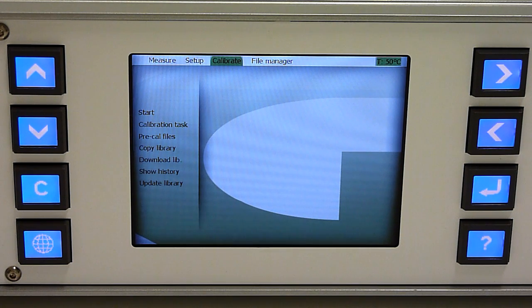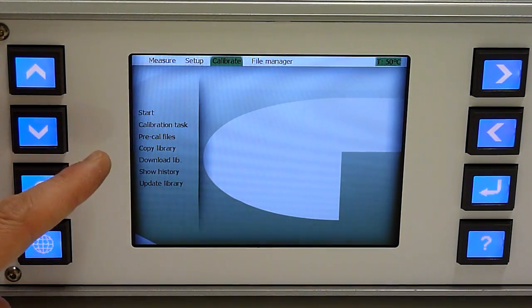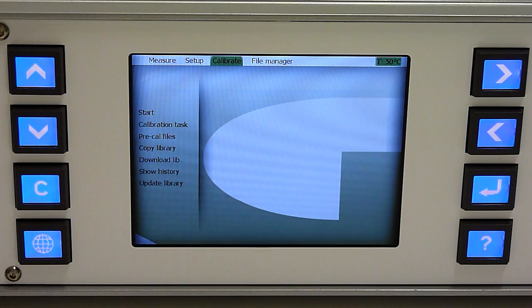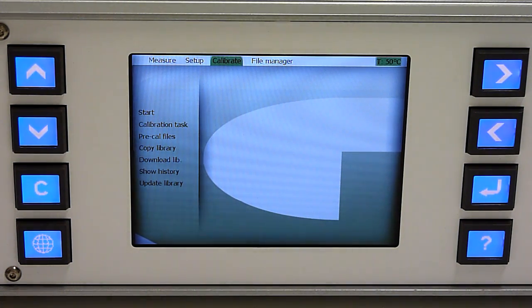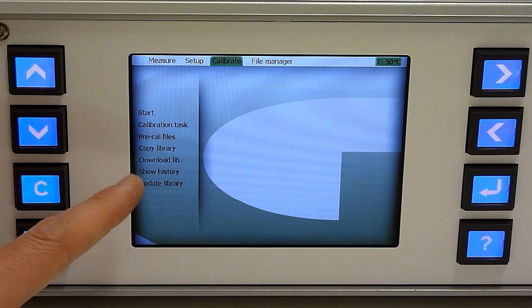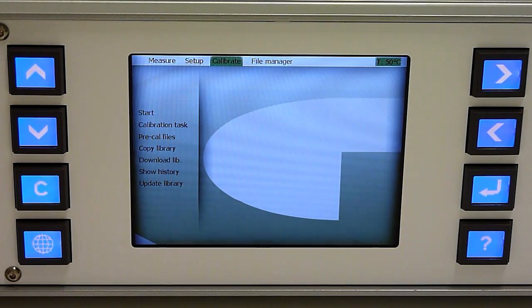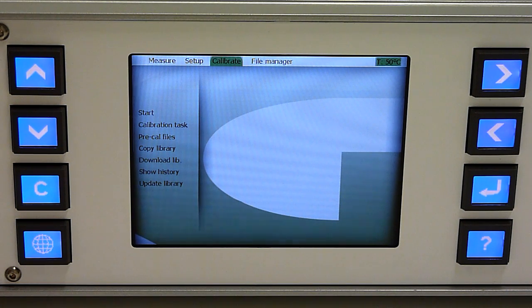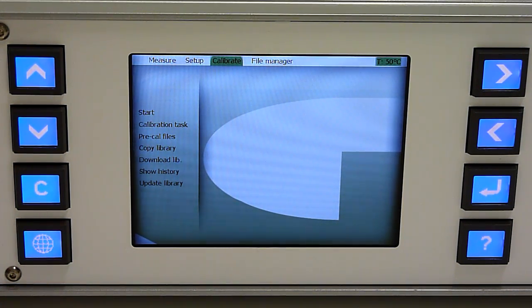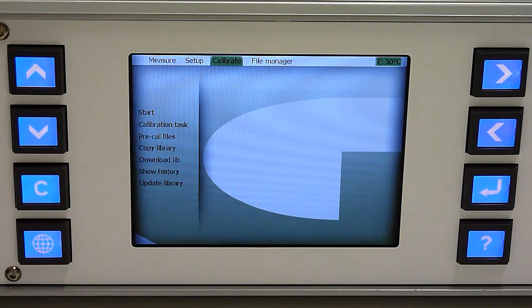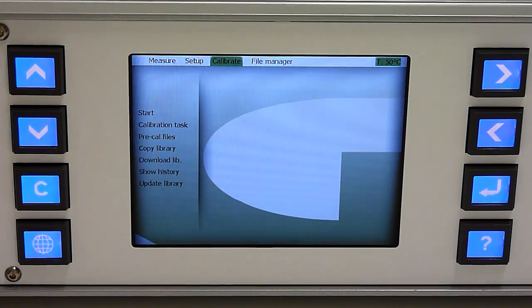You can download pre-calibration files, back up your existing calibration library from the instrument, download an existing library elsewhere, show the calibration history, or update the library if you have just recalibrated, for example, moisture and you don't want to recalibrate all the other gases.